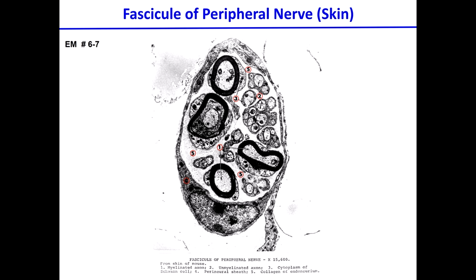I'm sorry, but I cannot hear. Oh, the Schwann cell is much larger than the satellite cell. It's always located only in one position relative to the axon, and the satellite cells may be many surrounding the axon and are much smaller and all nucleated. So you're going to be able to distinguish it that way.